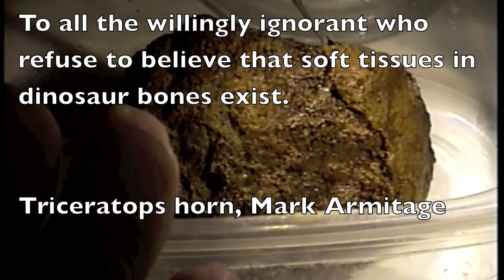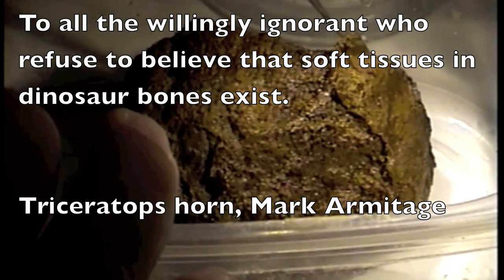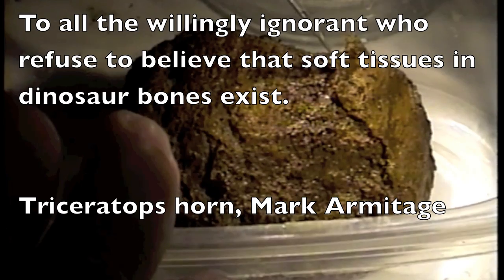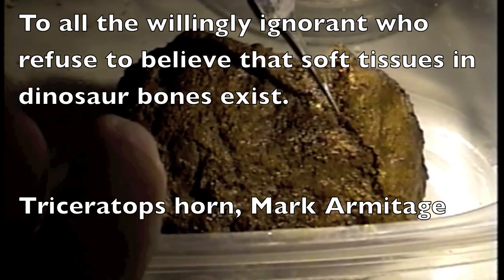Hi folks, Mark Armitage here with a brand new video that I've not yet put up on YouTube because I didn't think it necessary. What you are watching is me peeling soft fibrillar bone from the deep inside core center portion of the Triceratops horn.